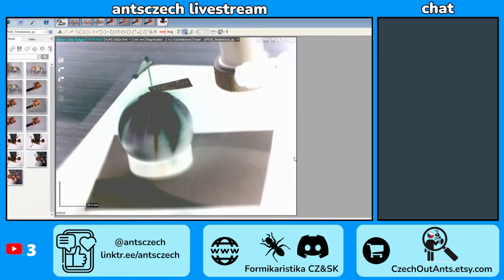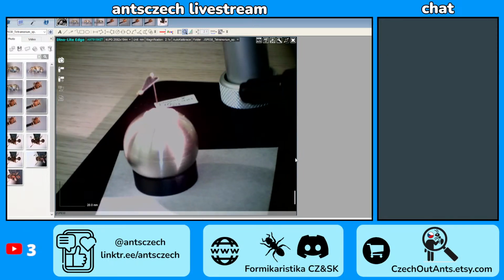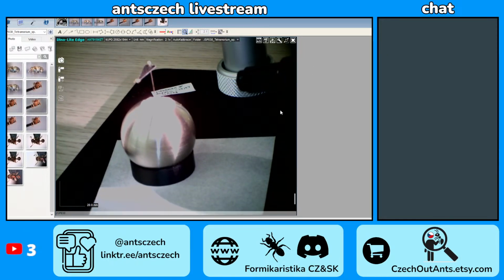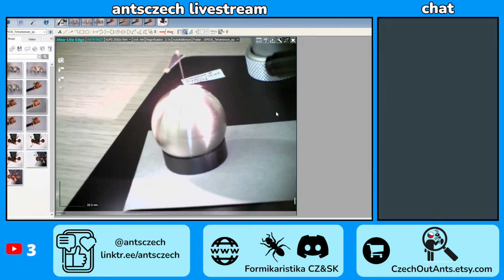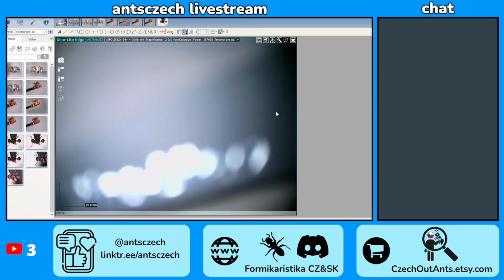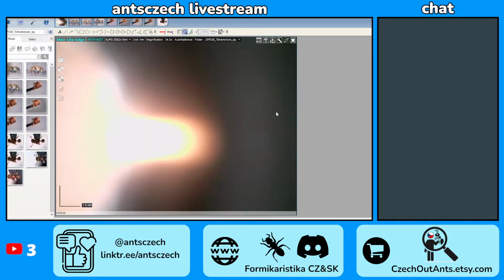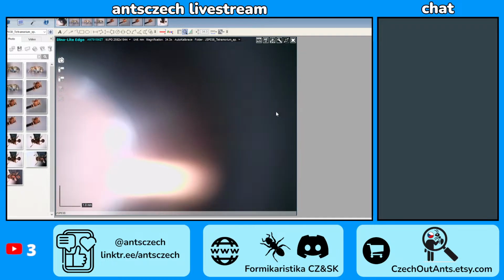Well, you can do negative. It will show on the stream after half a minute. It's a handy tool. It looks great. Oops, it was negative for a short second on the stream.